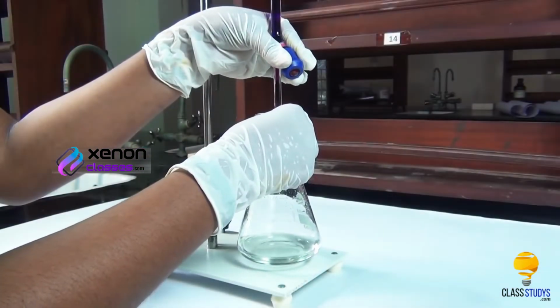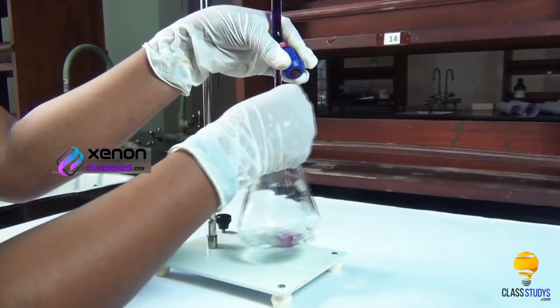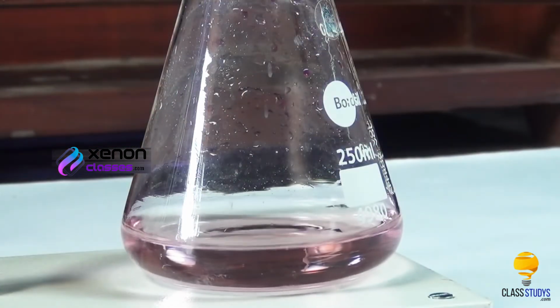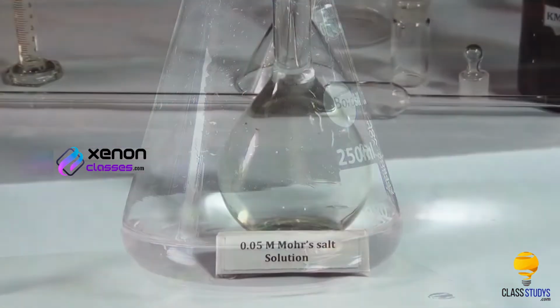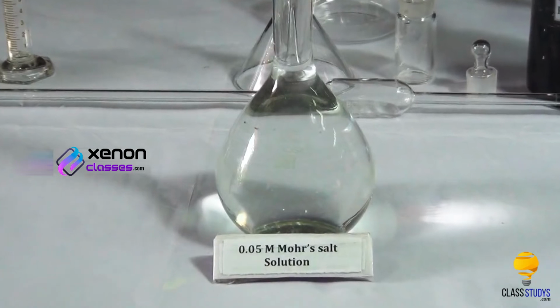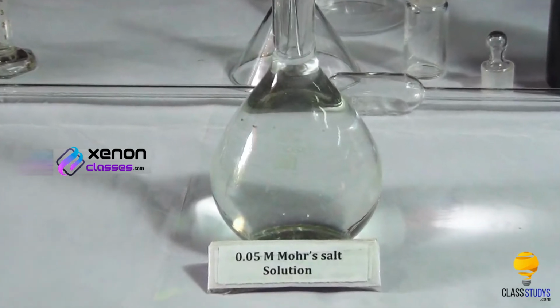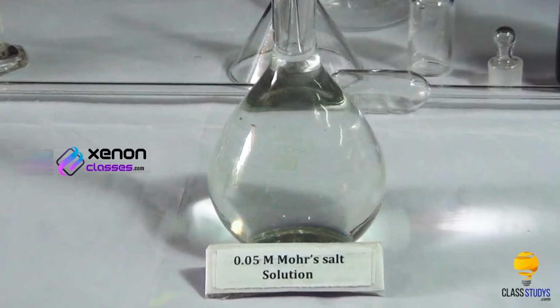The potassium permanganate solution is added drop by drop until the point that the permanent pink color is seen. This is called the end point. Our aim is to determine the strength of a given potassium permanganate solution by titrating it against a standard solution of Mohr salt.